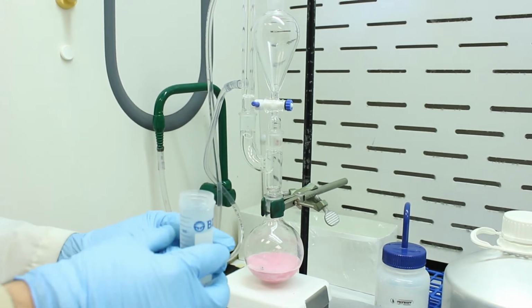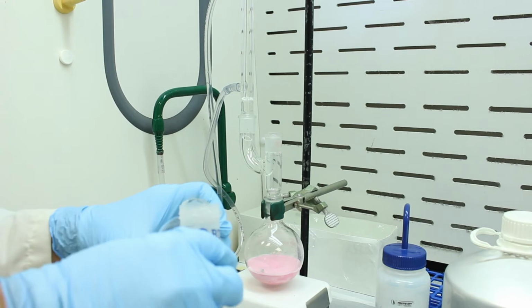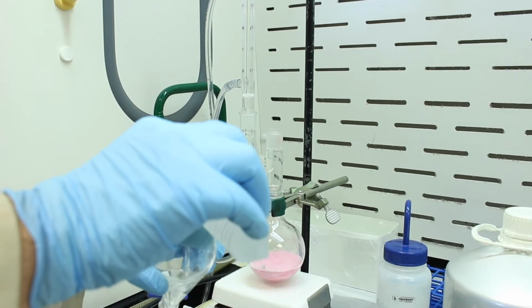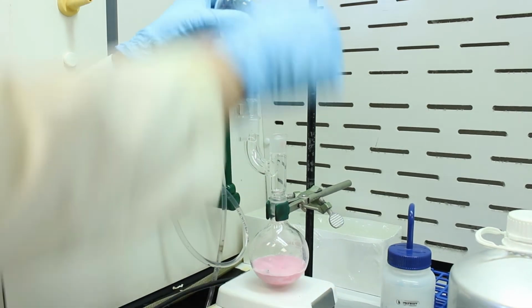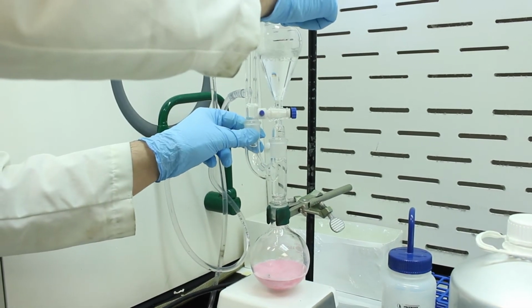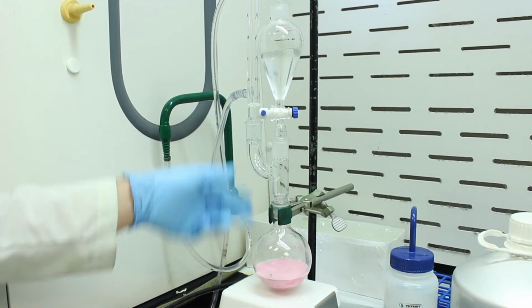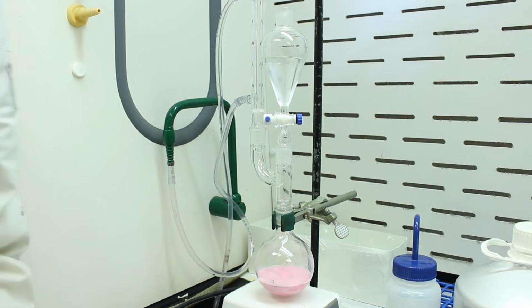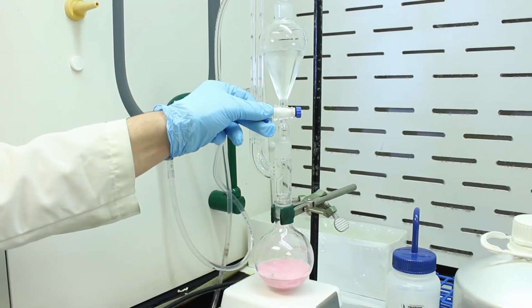Okay, so we have some 3 molar hydrochloric acid here. We're going to add it to our sep funnel. Okay, and we're going to start dripping it in. This will destroy the adduct, so it will protonate the alcohol and keep the magnesium salts in solution, and dissolve any residual magnesium that wasn't consumed in the first step. So we'll begin adding it slowly.